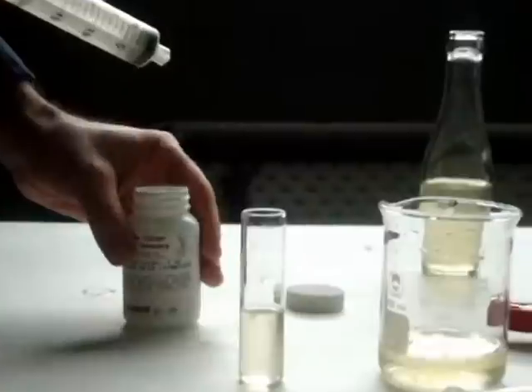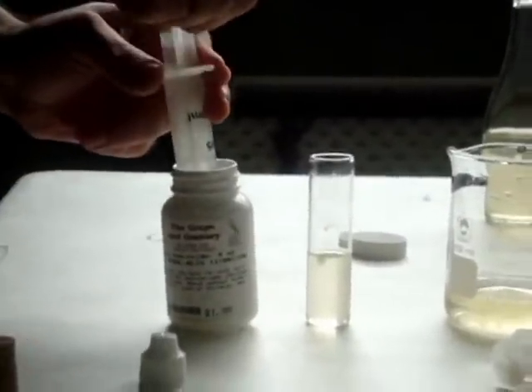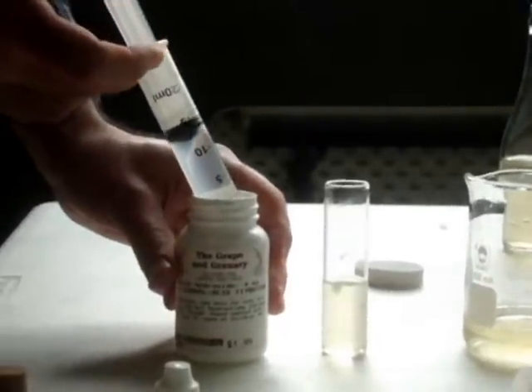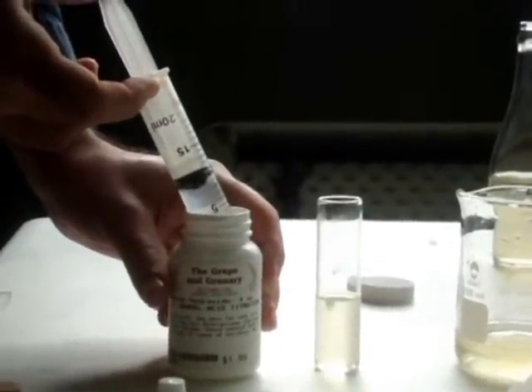Basically what we're doing is we're adding an alkaline substance to an acidic one. The alkaline substance is the sodium hydroxide, and the acidic substance is the wine. If we know how much of the alkaline substance it takes, we'll know how much acid we have. So I'll draw up 10 cc's of the sodium hydroxide, and I'll add it one milliliter or one cc at a time, watching for a color change.